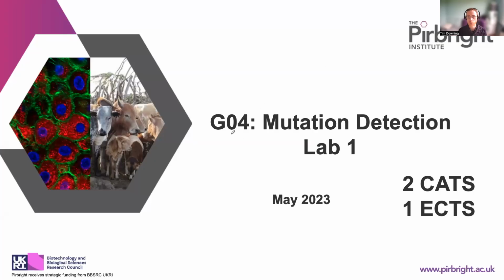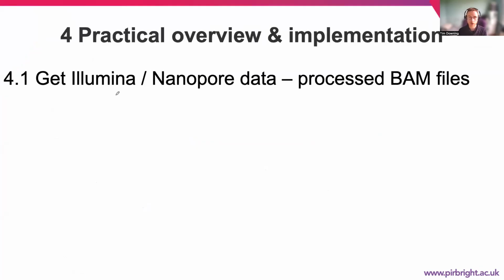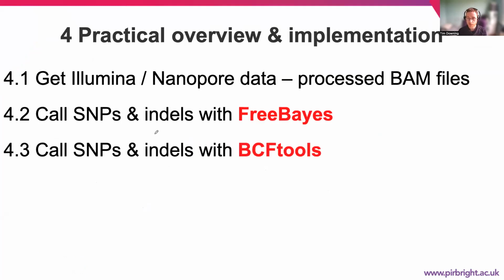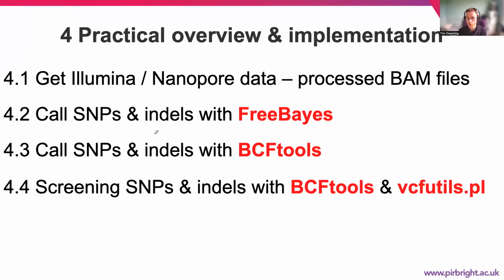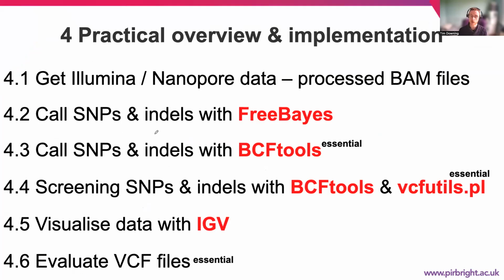Welcome to Lab 1 for our course G04 mutation detection. In this video, we're going to cover the practical details. We're just going to focus here on getting our data before we move on to the subsequent steps that are in separate videos on SNP calling and indel calling with Freebayes, then also with BCFtools, screening with BCFtools, visualizing with IGV, and then evaluating our SNP data at the end as well.